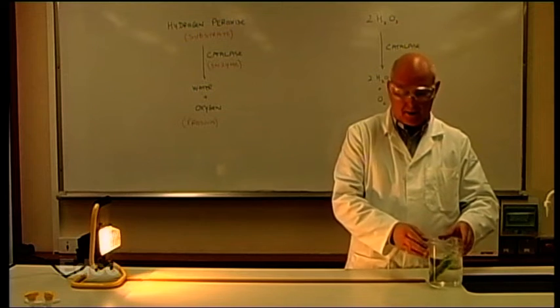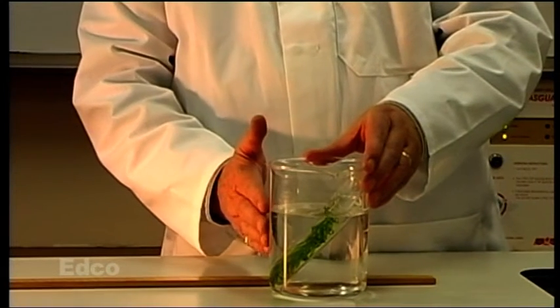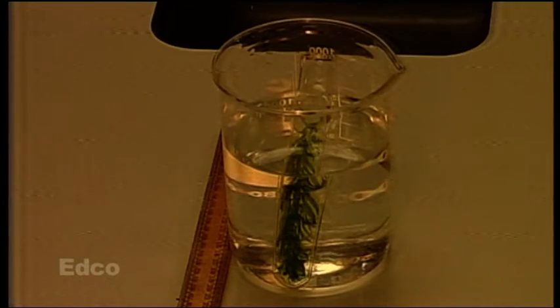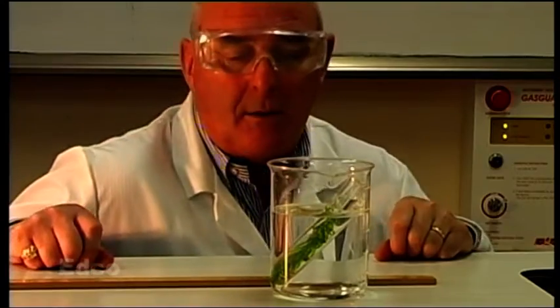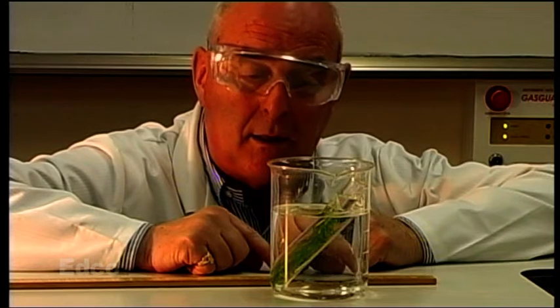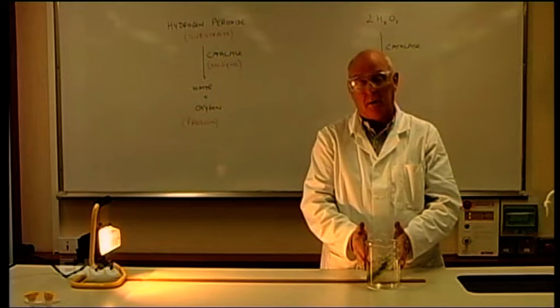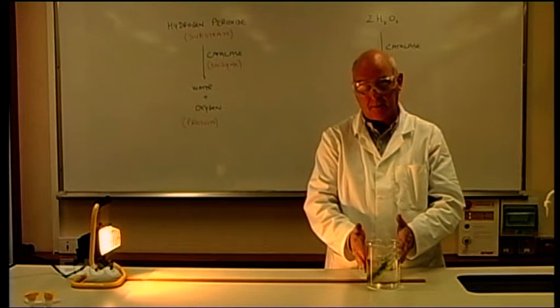We now move the apparatus in to the 80 centimeter mark, lining up the front of the water bath with the 80 centimeter mark. And we have to leave the apparatus there for 2 minutes to stabilize. Having left it for 2 minutes, we count the number of bubbles per minute, 3 times, and calculate the average. At 80 centimeters, the average number of bubbles per minute was 12.